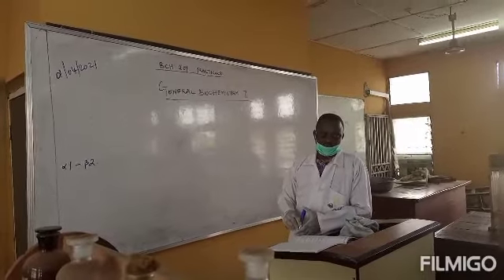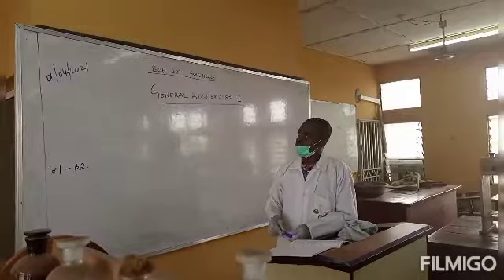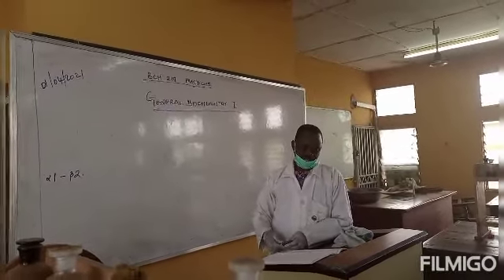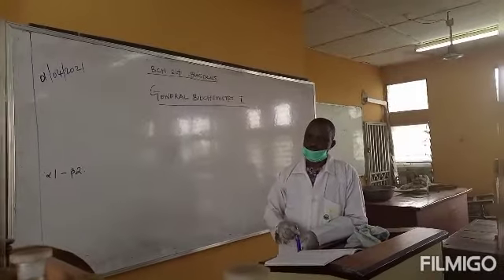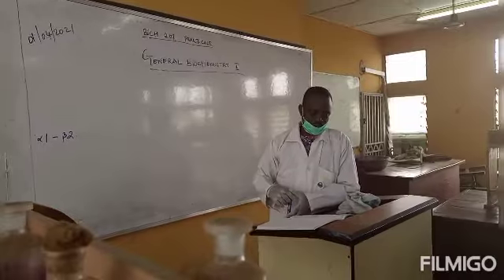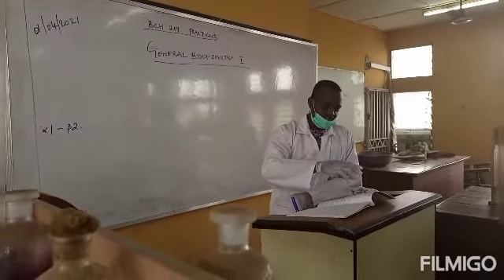Today we shall be taking a look at the reactions of carbohydrates. Under reactions of carbohydrates, we shall be looking at the Molisch Test and Benedict Test, and these two tests shall be applied on some carbohydrates that will be prepared for us. In order to have a deep knowledge of the topic, it has also been taken in the theory class.